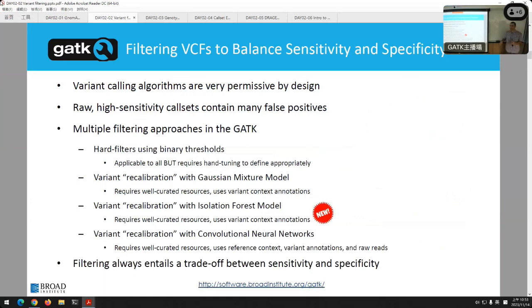You might think we've done all this work with the HaplotypeCaller. There was a lot of math that went into it. We've been doing this for years. Why do we need to filter any variants? Why are there any mistakes? The answer is, again, the sequencing technologies are not perfect, and the human genome is very complicated, and the reads are relatively very short, and so we still make mistakes.